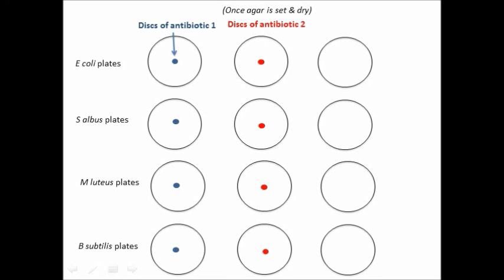Now repeat the process with your second antibiotic disc using your second plate for each species. And then finally, place one disc of your third antibiotic into the third plate for each species. Thus, each species now has three dishes, each one exposed to a different antibiotic.